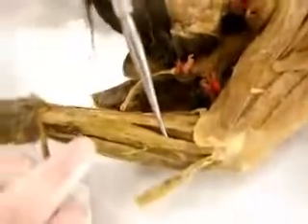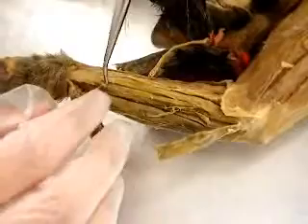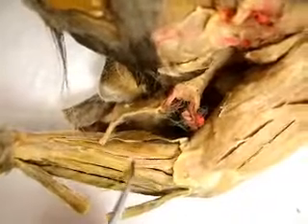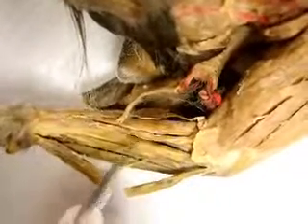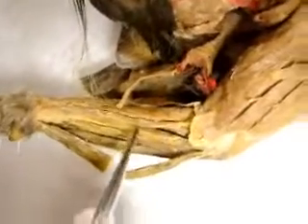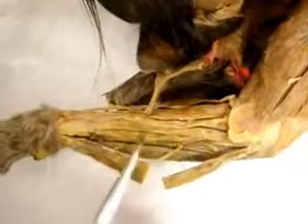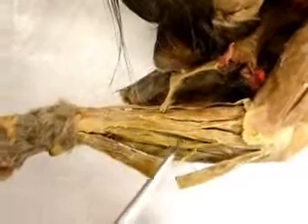Flexor carpi radialis is right here. Right here is flexor digitorum profundus. Pronator teres is right here — it's a really long muscle, this one right here. And then flexor carpi radialis is this one, and right next to it, it's really deep and it's hard to get into — that's flexor digitorum profundus.